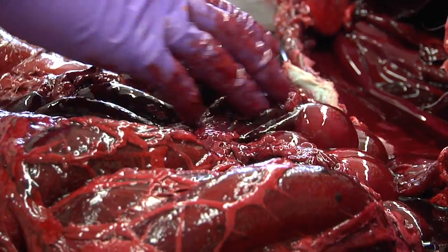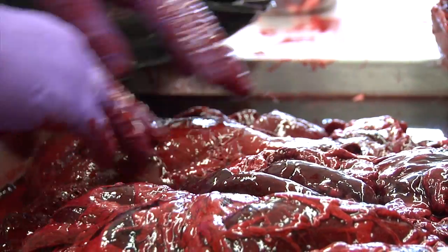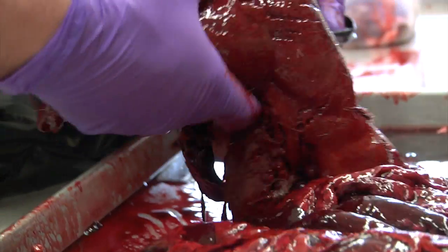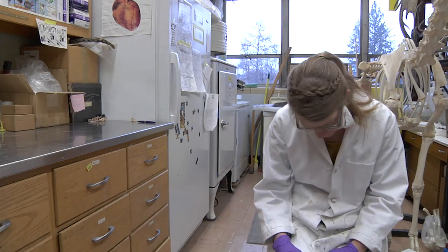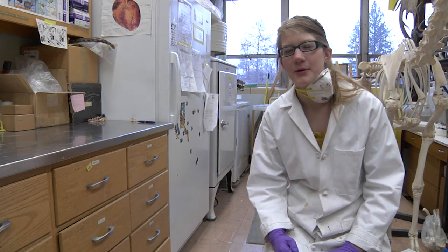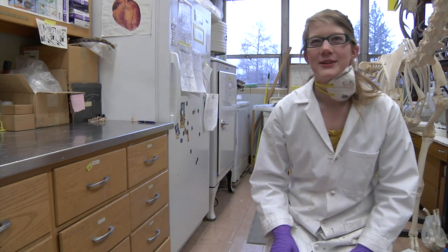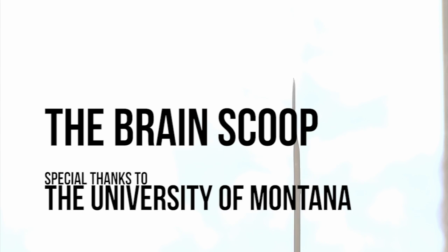This is sick, you guys. I need to shower. This looks like liver — this is liver right here. Intestines and tubes — large and small intestine. Looks like the kidney. You can see how big the liver is — that's a heavy organ. Okay, let's get rid of it. Well, that was fun. Now we have the body prepared — all the organs have been removed. Hopefully we won't ever have to experience that horrific stench ever again. That was certainly a learning experience for everyone. It still has brains on it — that was fun, so we'll need it.